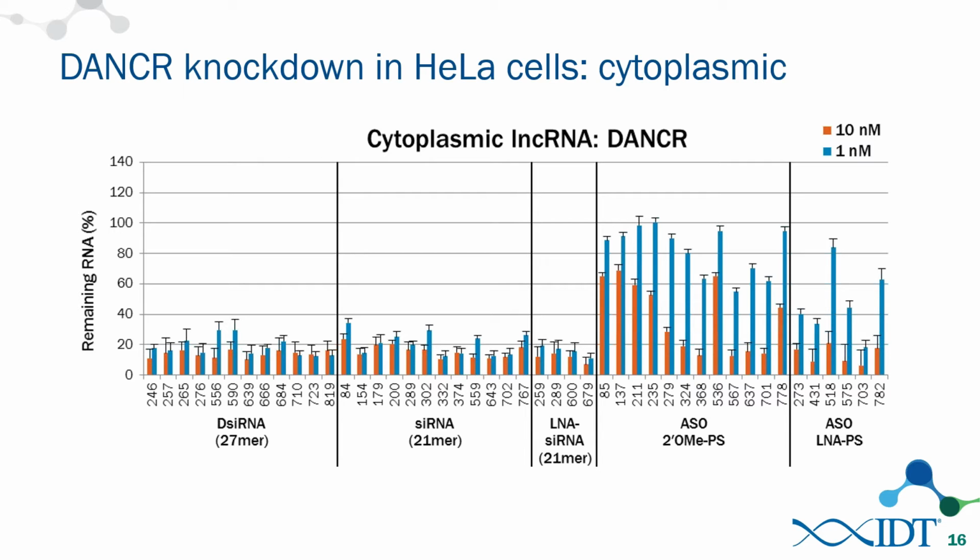And that was the second part of the question that the person asked, which was how could you predict them? So UNAFold is what you would tell people to look at? It's difficult to predict easily computationally. I've had success using UNAFold, and that's the software that I use, looking for accessible regions. And then after I find accessible regions, I design the antisense oligos using good criteria as far as the oligonucleotide is concerned, like GC content, making sure it doesn't self-dimerize and that sort of thing.